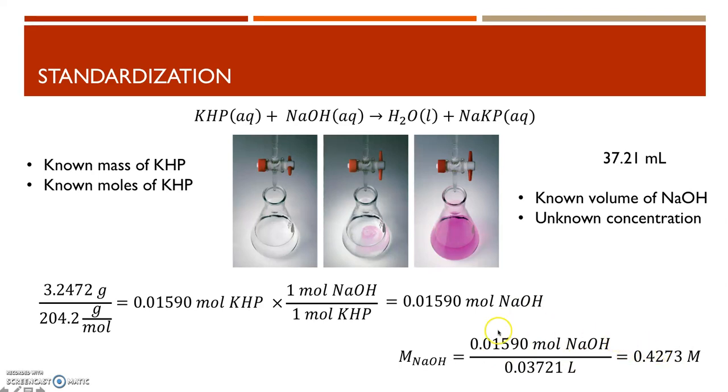In lab, you'll be doing one standardization run so that we can focus on getting statistics for using the burette and an indicator versus the digital version, which is the drop counter, the Vernier drop counter.